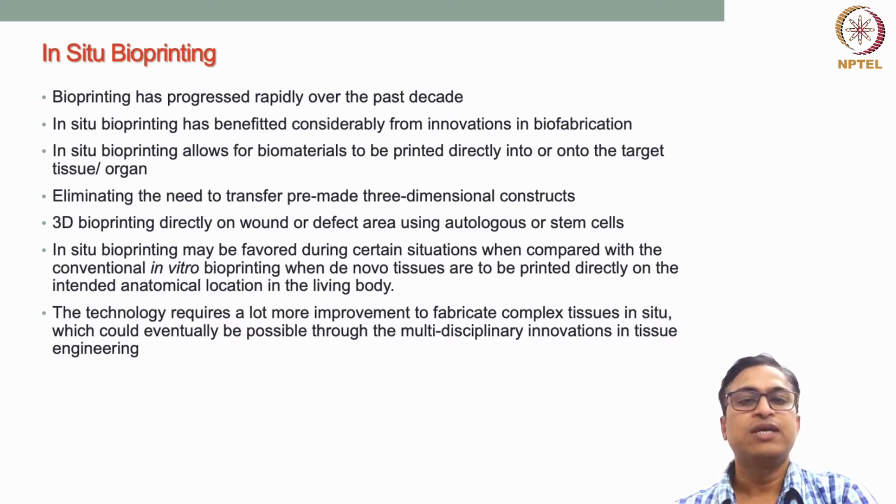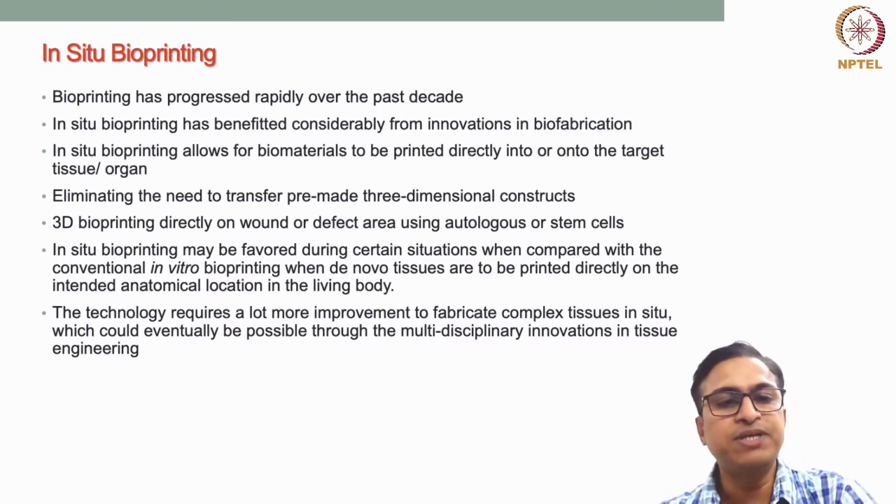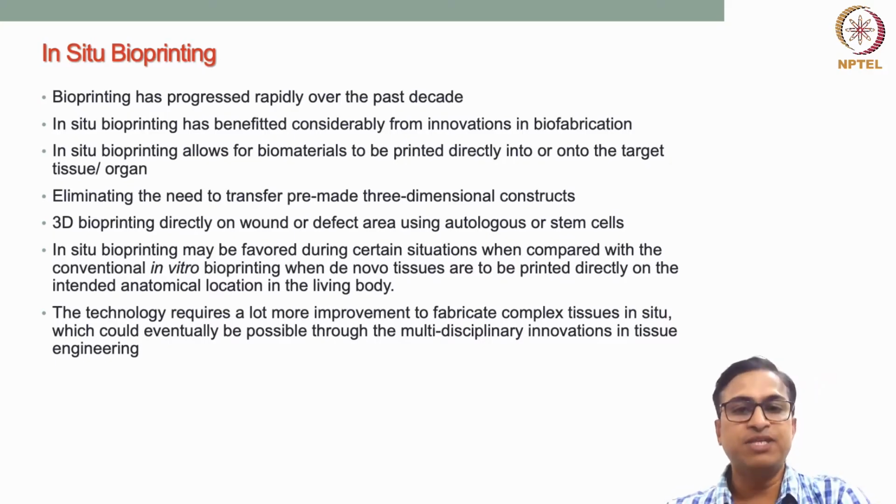That's why in situ bioprinting has developed in the last few years as a process to directly deposit the cell-laden structure on the wound bed. So in situ bioprinting has benefited from other innovations in biofabrication. And it actually allows the biomaterial to be printed directly into or onto the target tissue or organ. So that's the advantage.